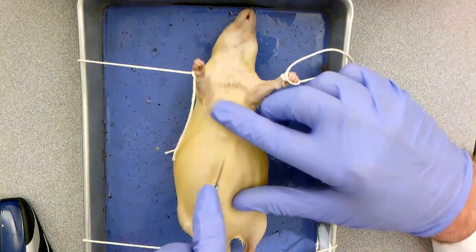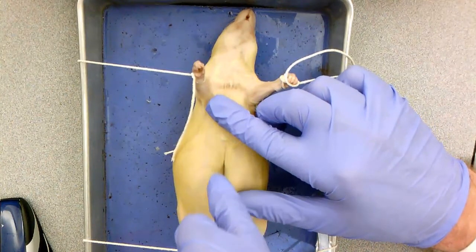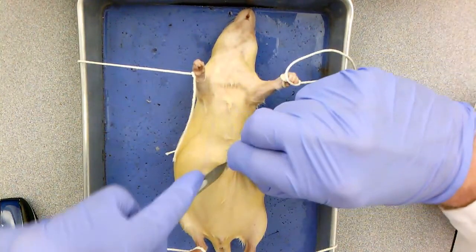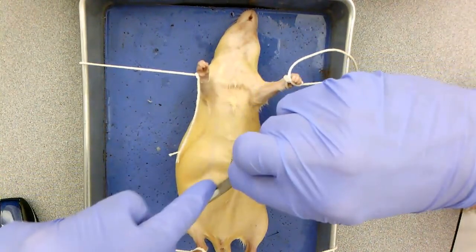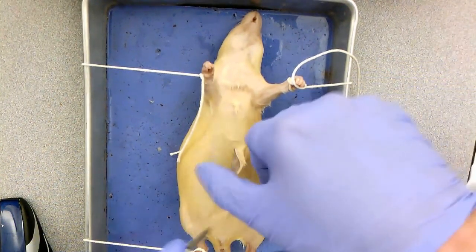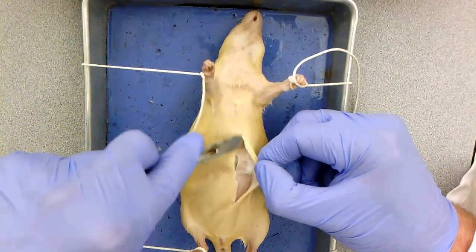So I'm just going to take my scalpel and make a small incision, just going into the skin. Now that I've made my way into the skin, I can peel this skin back, and I'm going to see some white tissue in there. It's called areolar tissue. It's one of the most widely distributed connective tissues in our body.